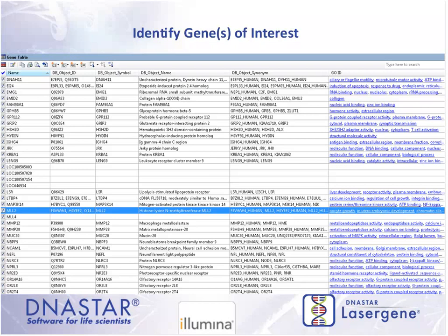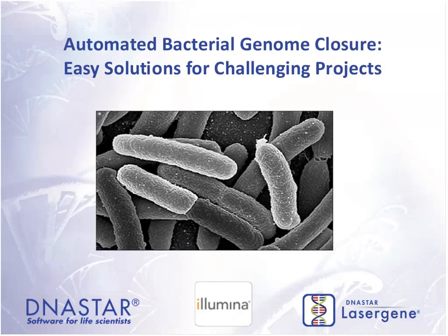DNAStar has an expanded capacity to bring in database information to populate this table with information that may be interesting to you. You can bring in a VCF file, for instance, depending where the VCF file originates, you might have other database information like PolyPhen or OMIM, or again, other annotation databases. So great, easy to use software, allows you to find areas of interest. So with that, that was kind of our run through of GWAS, or a multiple exome type analysis.